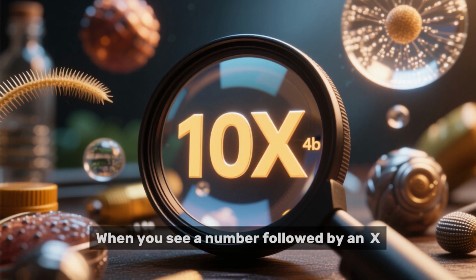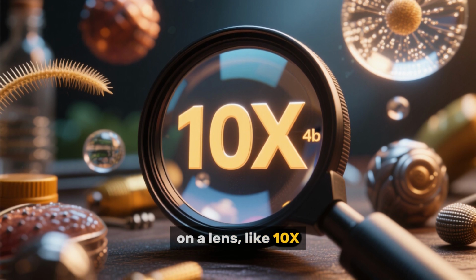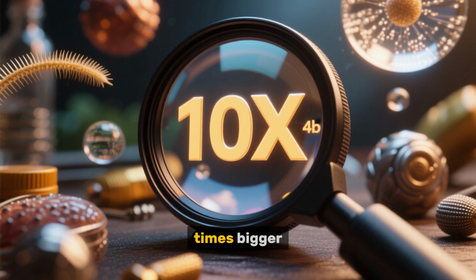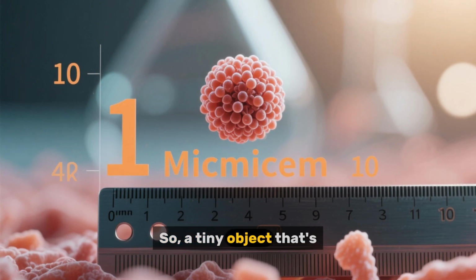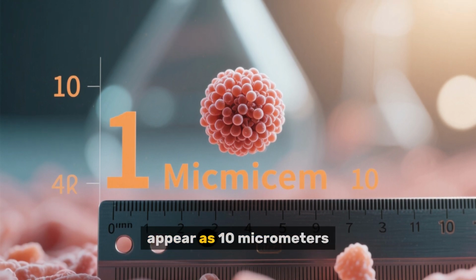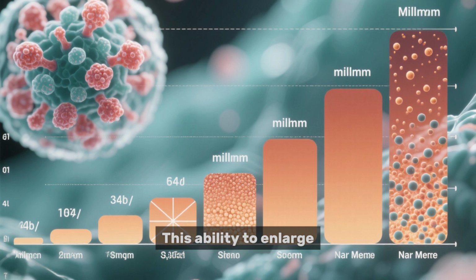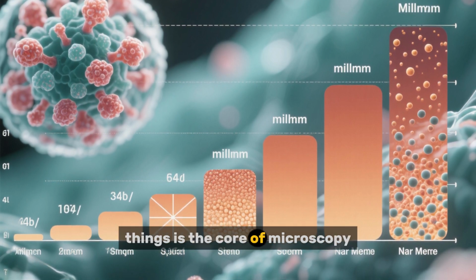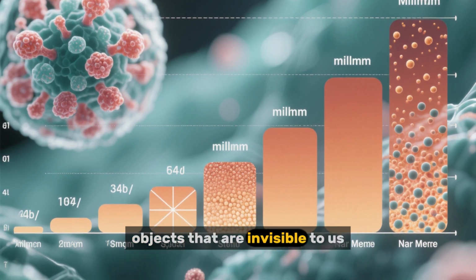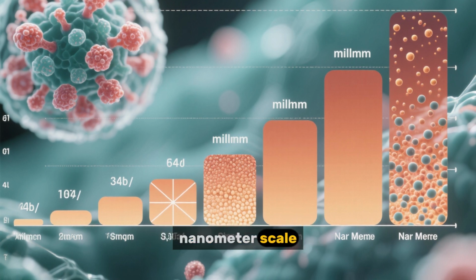When you see a number followed by an X on a lens, like 10x, it means that lens can make an object look 10 times bigger. So, a tiny object that's just 1 micrometer in size would appear as 10 micrometers through that lens. This ability to enlarge things is the core of microscopy, the technique we use to view objects that are invisible to us, from the millimeter all the way down to the nanometer scale.